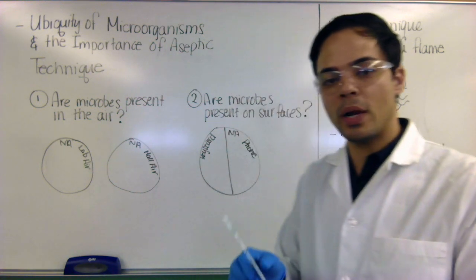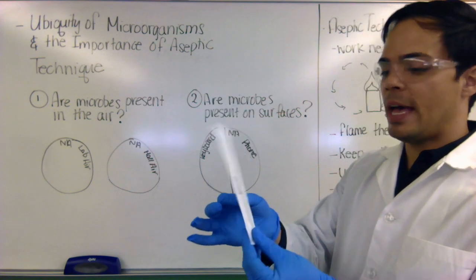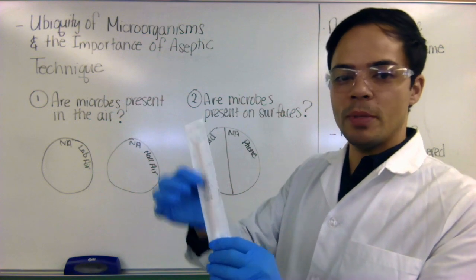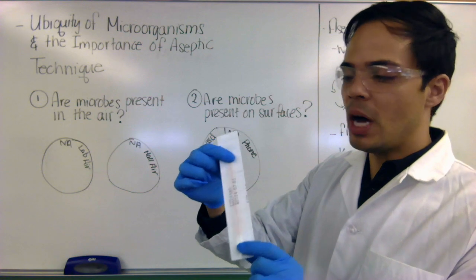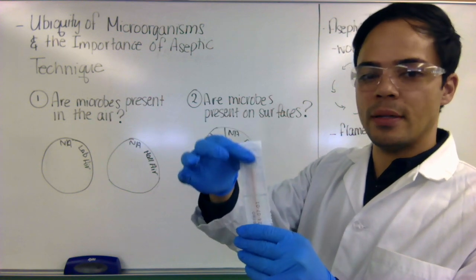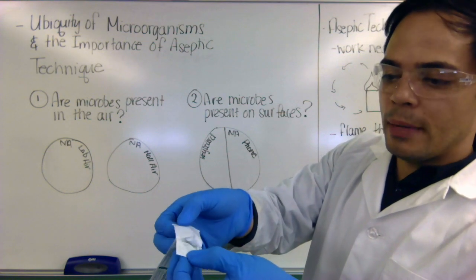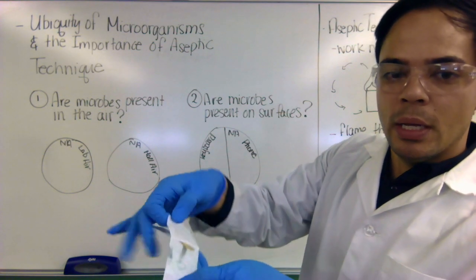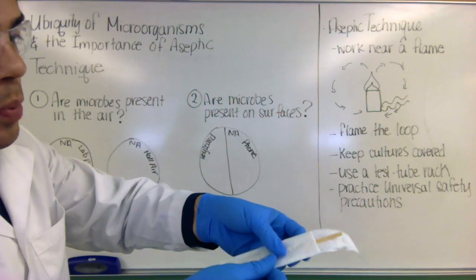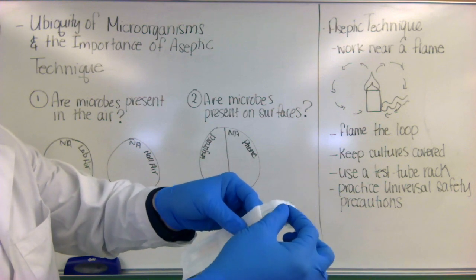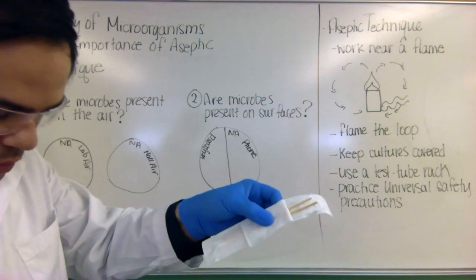And to get the bacteria, what I'm going to use is I'm going to use sterile swabs. And the way you open a sterile swab is you look for the end that has the stick, not the end that has the cotton on it. And you want to open this end, the end that has the stick. So you want to go like this, open it up. Now we want to try to keep this as sterile as possible. So I'm just going to open it a little bit like that. And this comes with two in it. So I'm going to save one for the keyboard, one for the phone.